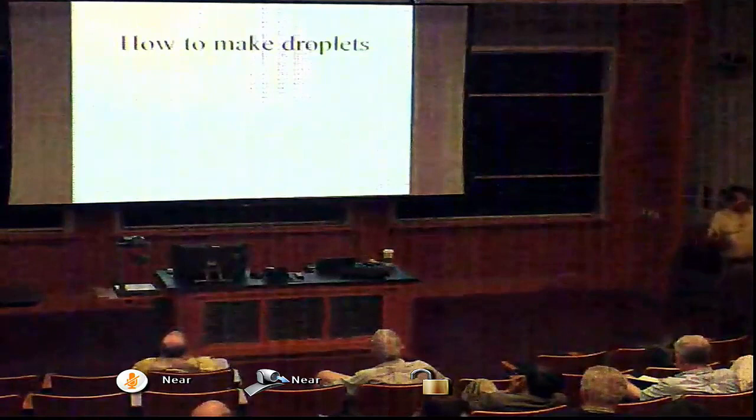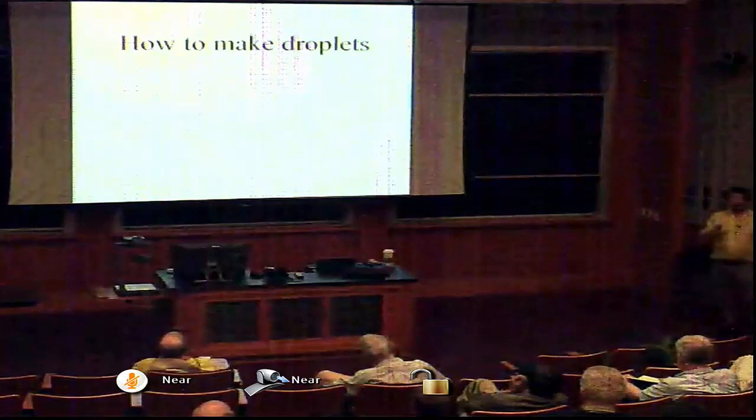So how do you make the drops? Well, this is really the key to everything. It's based on hydrodynamic instabilities, and I'm going to show you what I mean by that. First, here's how you make the drops.